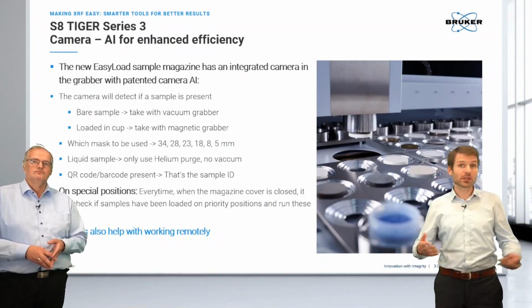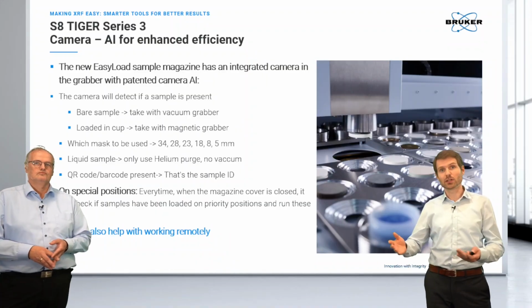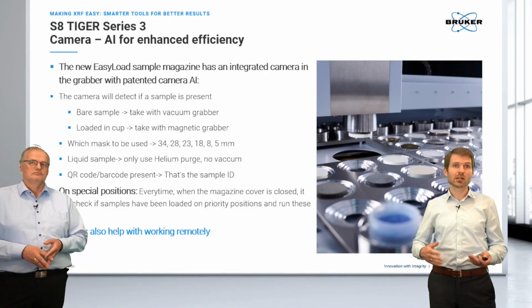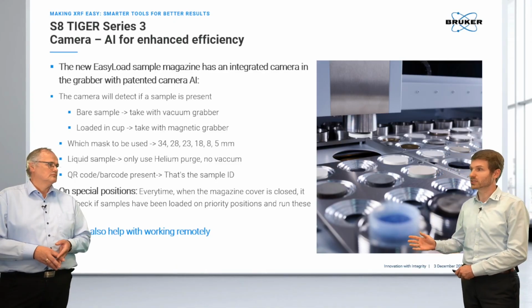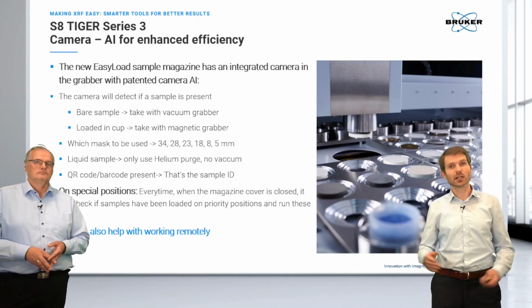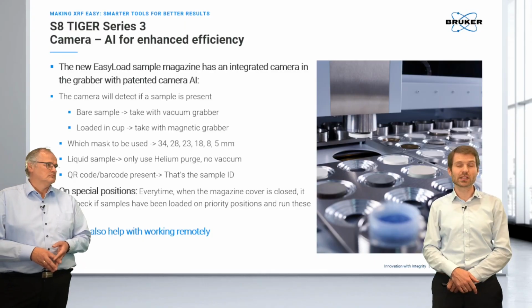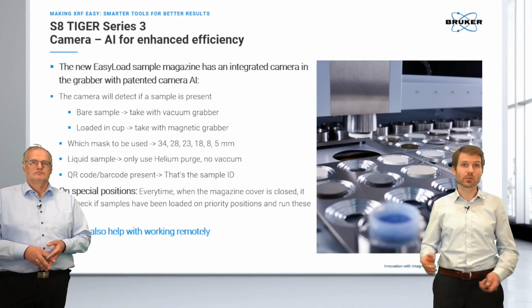Yeah, so now we've seen a little bit about the software, Kai, and I guess our audience has a little bit of a grip of how to use it. But we also have certain features that, once the solution is set up, so once the calibration is running, really help you to streamline your process to ensure that you don't have any issues when running it in routine operation, also from a remote place.